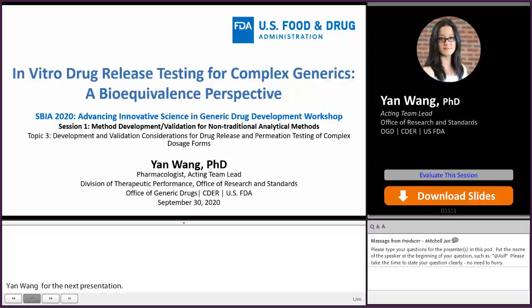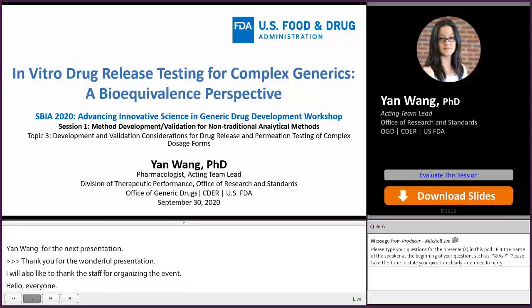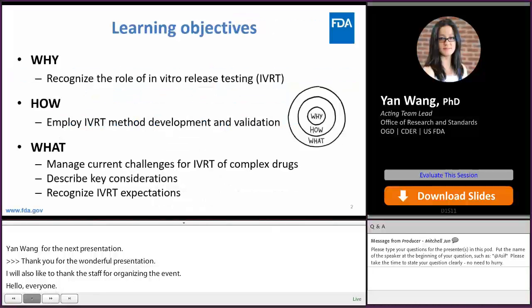Hello, everyone. Today, I'm going to speak to you about in vitro drug release testing for complex generics from a bioequivalence perspective. Here is the outline of my presentation. I will discuss the golden circle for in vitro drug release testing.